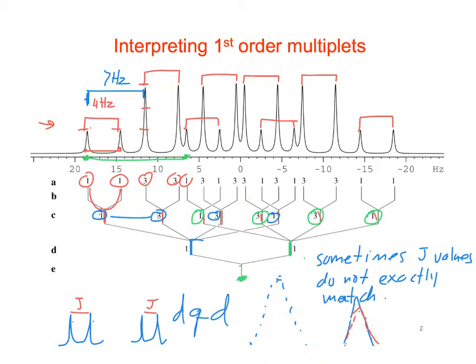And what you can even do, you can either sample over 32K, or what you can also do is just add another 16K of zeros after you've done your experiment. They call it zero filling. And so then when you do the Fourier transform, it's calculated over 32K of points. And it helps fill in the points on the curve. And so that's something that can help as well.